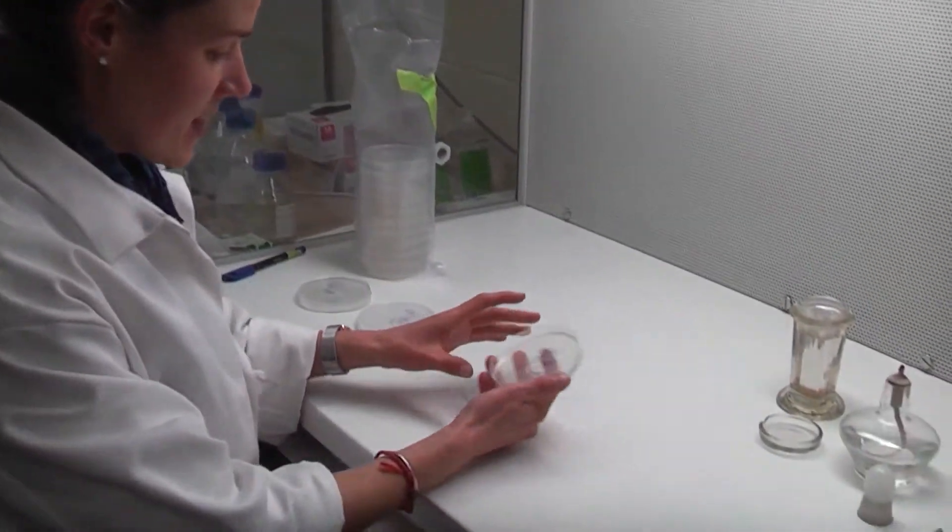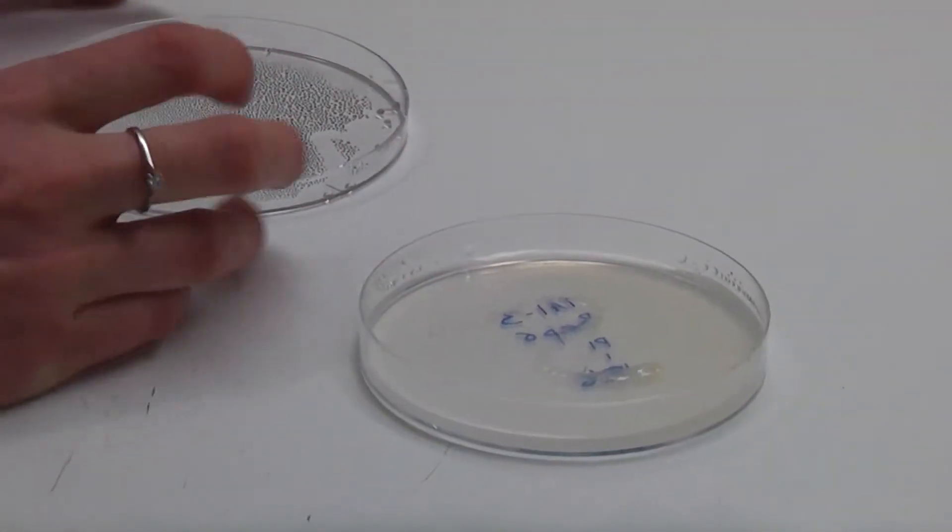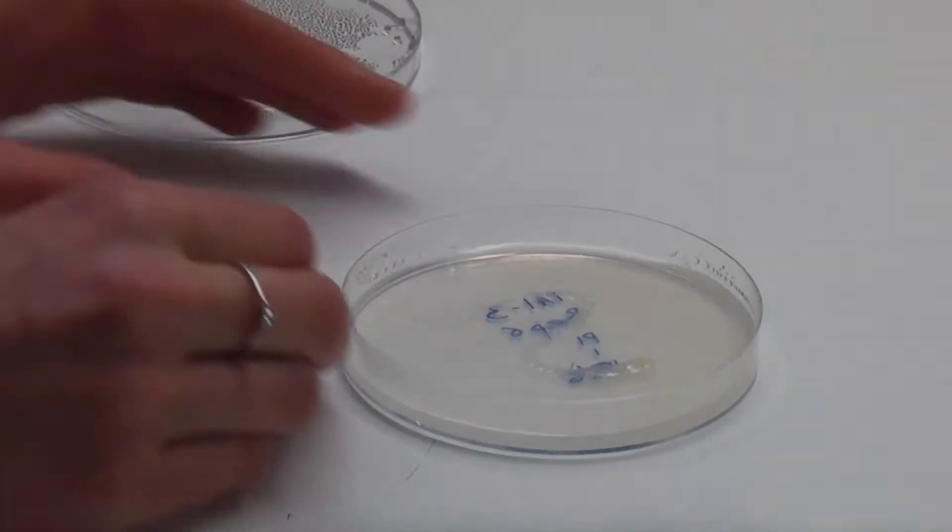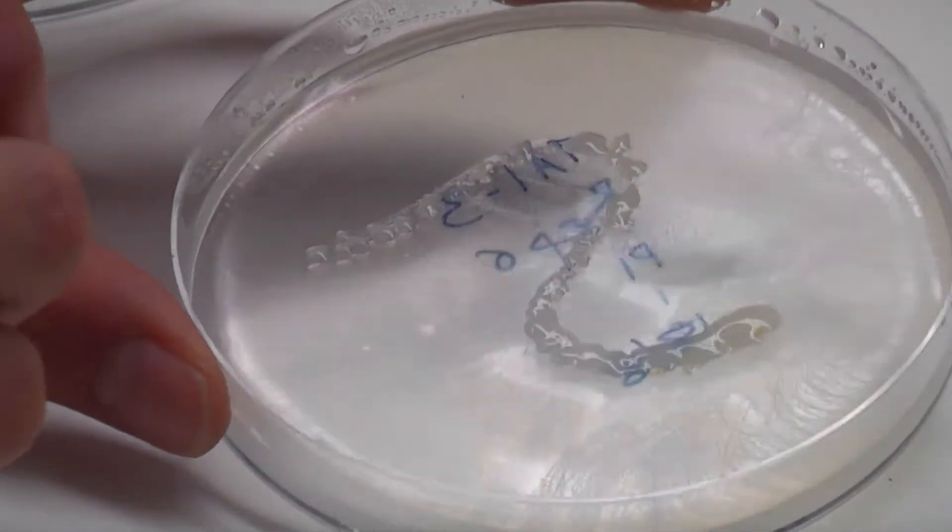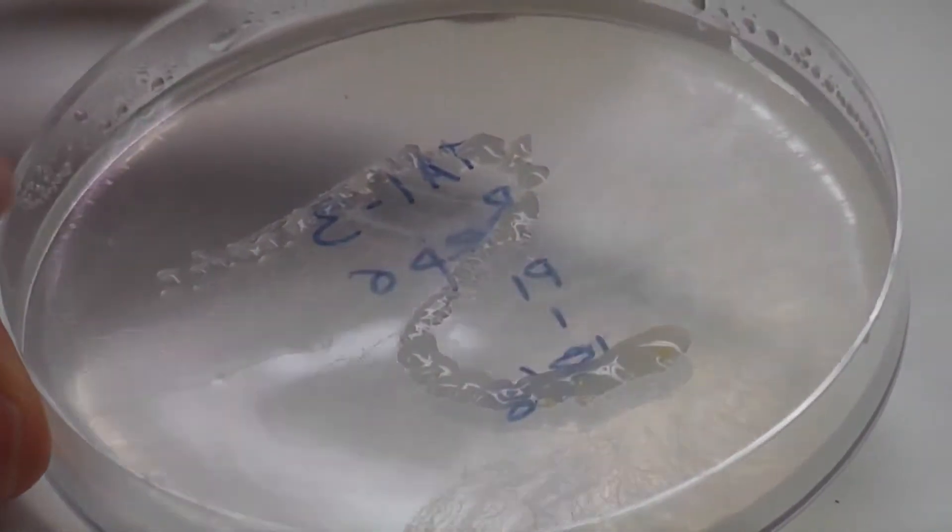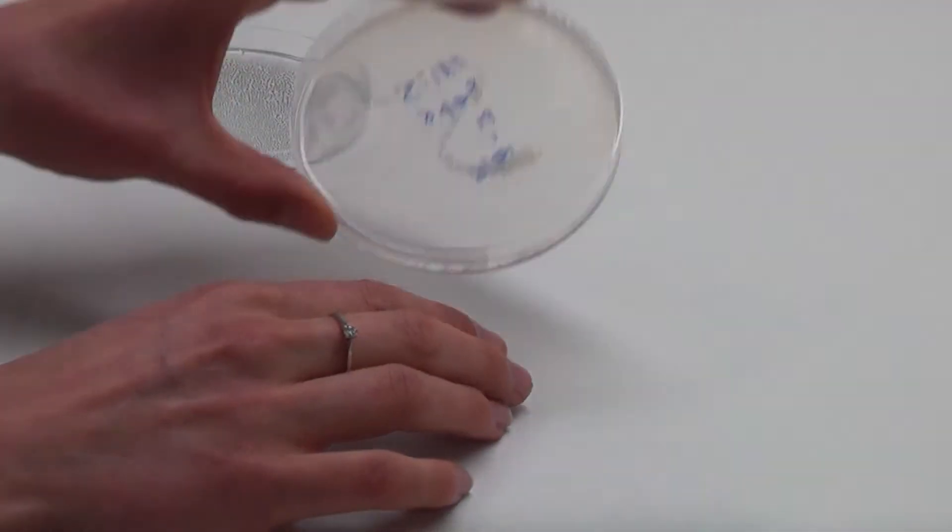So I have a plate here and as you can see it's got some other, it's not pure rhizobia. We're looking for the white gooey stuff rather than this. There's some psalis here and some yellowy things in there that we don't want.